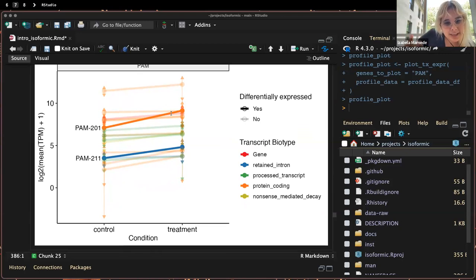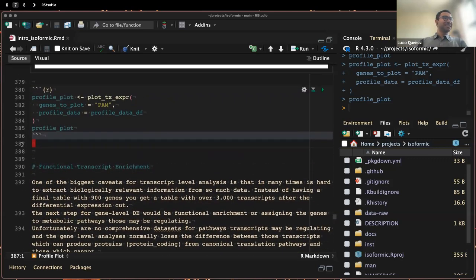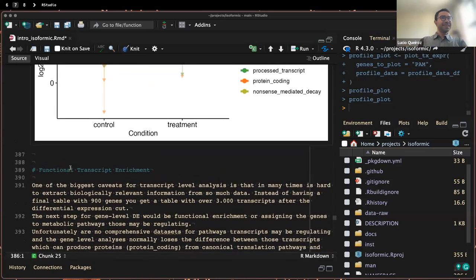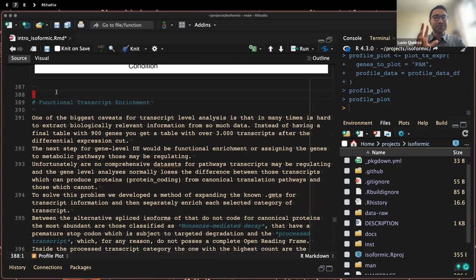But you see, I wanted this example. Oh, you did your favorite genes? Oh, that's good. That's how we start, doing. Like, if you have a favorite gene and you want us to try, just put it in the chat. Studying stroma or estrogen cancer? Cancer, matrix remodeling. Yeah, matrix remodeling cancer, because collagen is always there. If you have a favorite gene and you want to try, just say. This is a preeclampsia data set, but like I said, it's easy to adapt for other data.